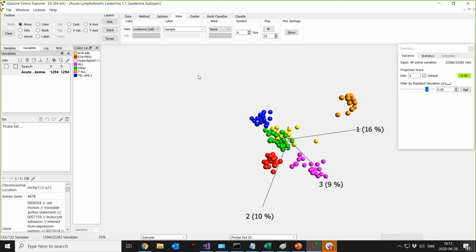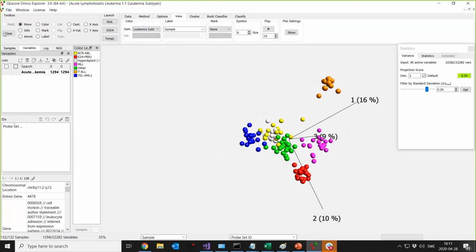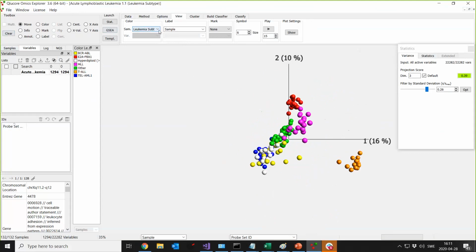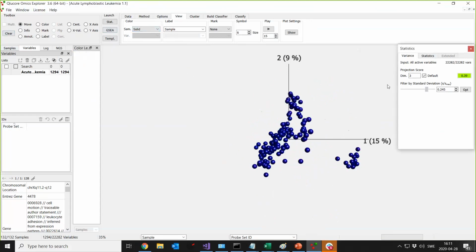I'm not going to go into detail today on how to discover groups in the data. I just wanted to show you the plot, but I also wanted to give you a context of what we're doing here. Let's go back to where we were, where we started. So where we started was just about here.